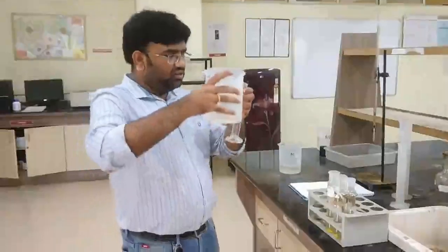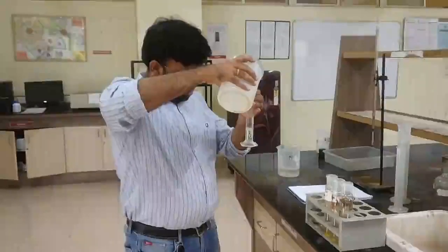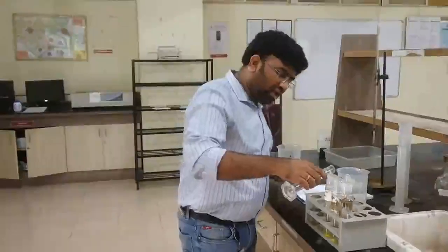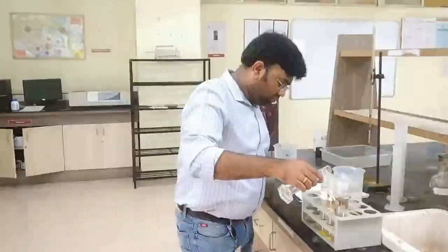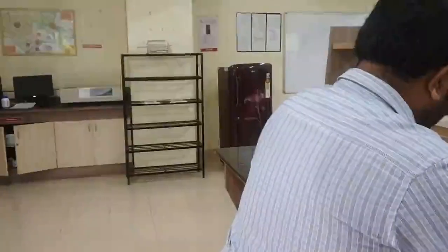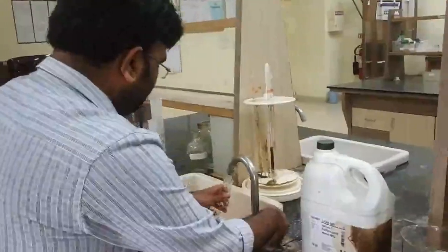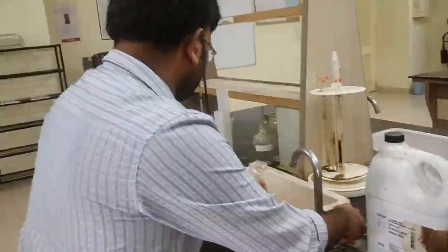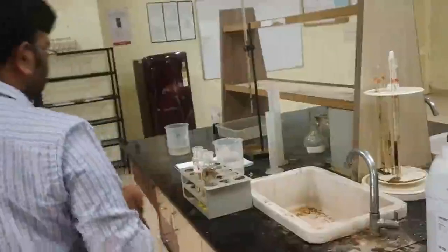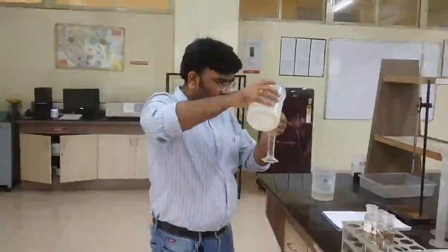As of now I am adding it into the blank. So I am going to measure 20 ml of distilled water and add it in the blank flask. Just a minute. I'll be washing this properly to avoid some failures, because this is our very reference flask.